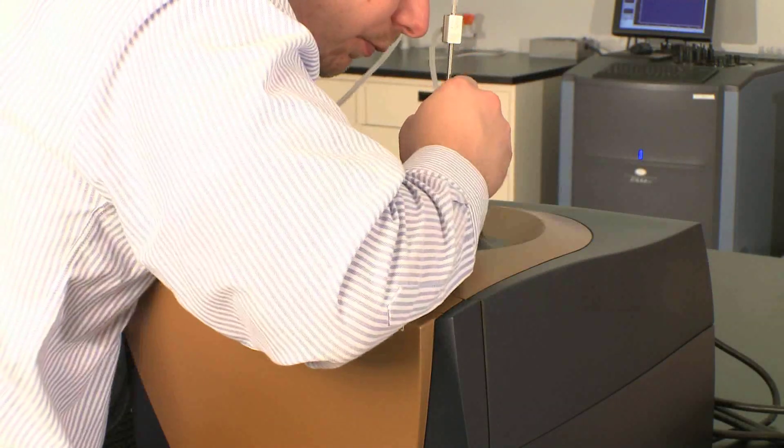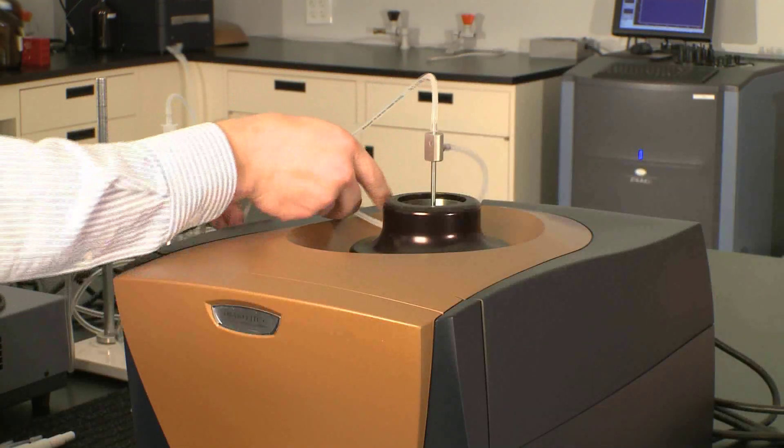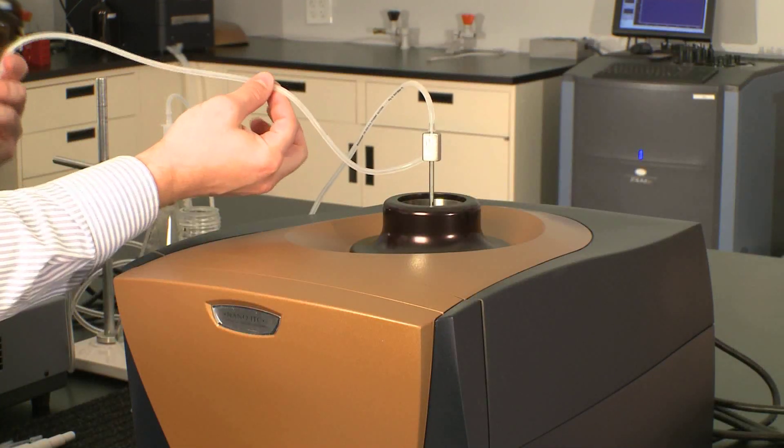You place this inside the instrument down into the cell. You have a connection that goes to your vacuum line, and you have a connection that goes to your cleaning solution.